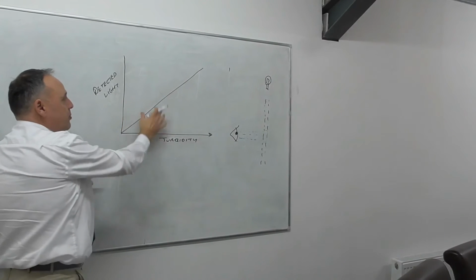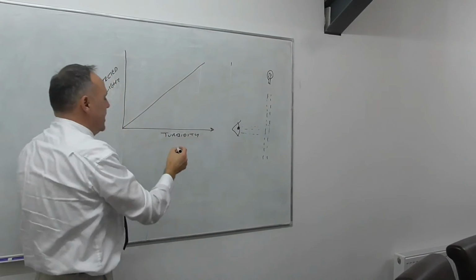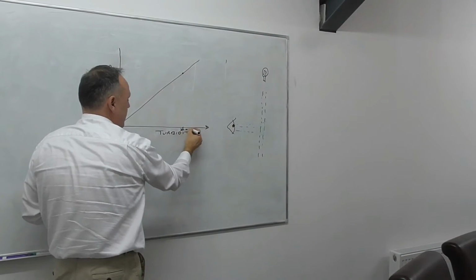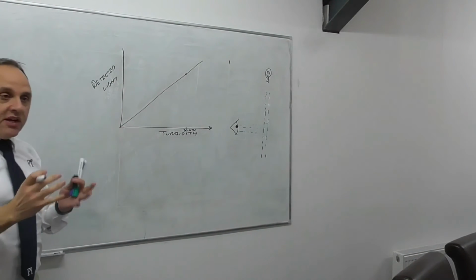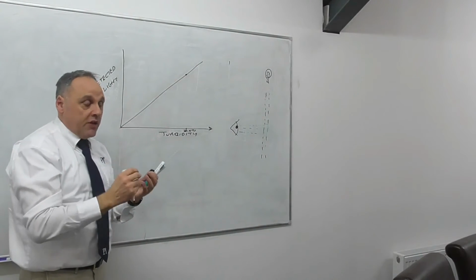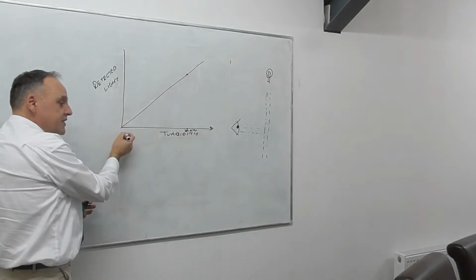Now the way we calibrate this so that we can tell you what the turbidity is based on what we're collecting is we put in a known sample of turbidity. So for example, 20 NTU, and then we put in a 0. Now that 0 is really, really difficult to do, partly because water itself with no particulate will give you a turbidity reading of about 0.018, but partly because it changes over time.